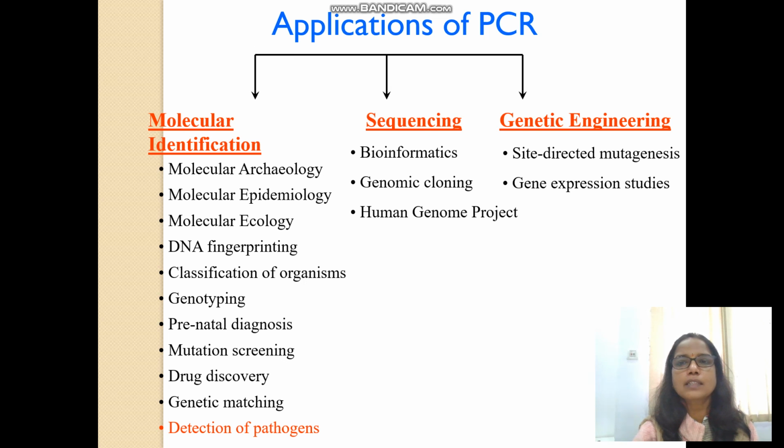Last but not least, it has been used for genetic engineering in site-directed mutagenesis, which is helpful for proteomic studies and in gene expression studies.